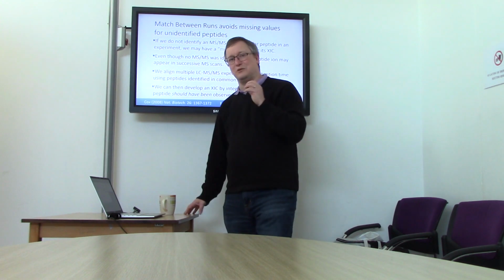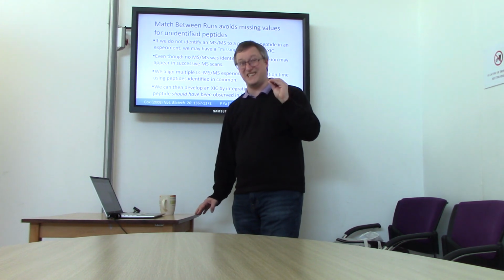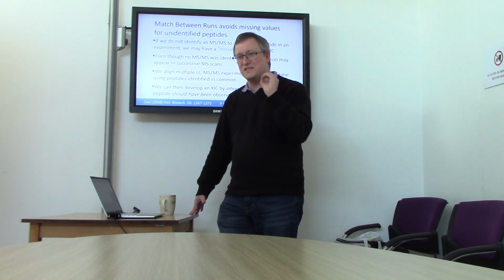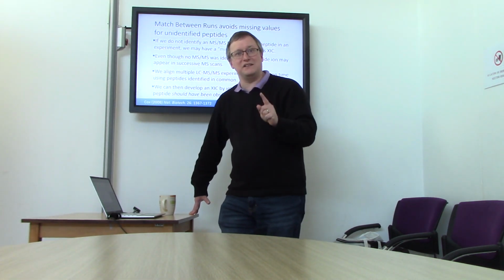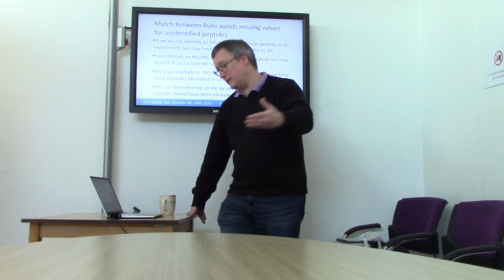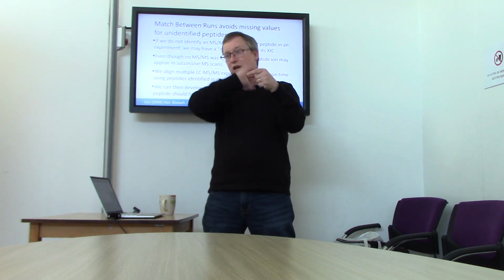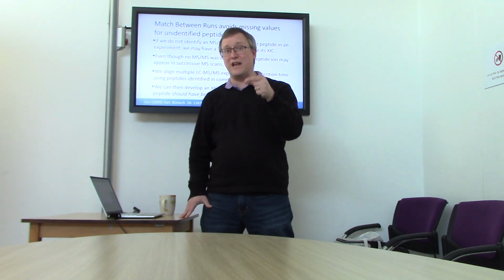If you know what it will do to your data analysis, you will also hate missing values. So we want to be able to find this intensity even though the peptide wasn't identified. So what we're going to do is expect that this peptide ion was visible in the MS of this missing value raw file, but we expect that if a tandem mass spectrum was produced, it was not identified successfully. So what we need to do is figure out what retention times we need to look at in this missing data file to say between what 2 times do we expect to see its chromatogram.